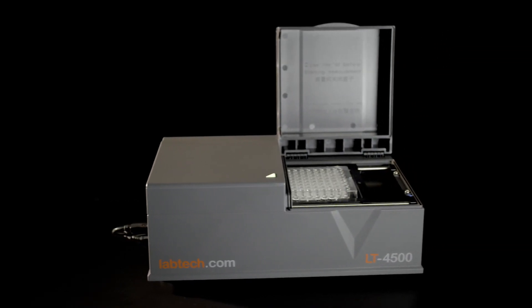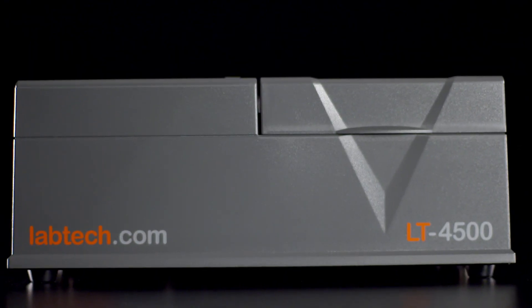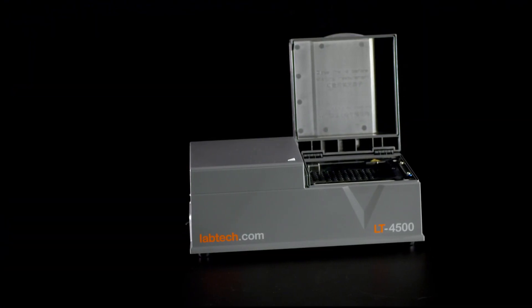With a compact design and tested reliability of over 100,000 plate reads, the LT4500 is truly top of its class.